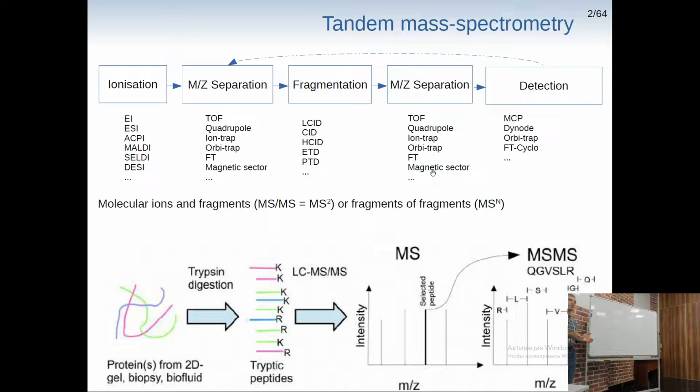We can filter some ions, and we also touched on this when discussing ion trap mass spectrometers, where we can isolate just one type of ion, then fragment it, then see what the fragments were, or even get rid of all the fragments except one, and fragment that again into smaller fragments. So, why is tandem mass spectrometry and this fragmentation of big importance for proteomics?